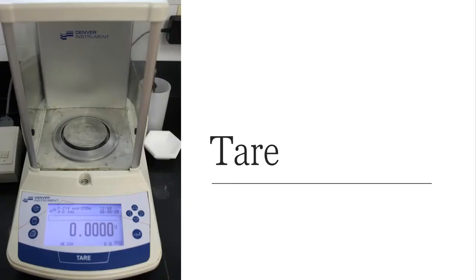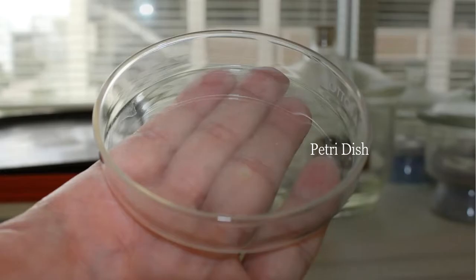All right, so I go to the balance. The lab directions tell me the very first thing I need to do is calculate the percent of water. The way we do that is I go to the balance, I hit the tare button, and I make sure all the doors are closed, like usual. My balance reads 0.0000, and then I take a Petri dish. The reason I take a Petri dish is because it's glass, and there is an edge all the way around it so that the nut chunks will not just fall off of a watch glass. This is going to keep it contained, and that's exactly what I want.